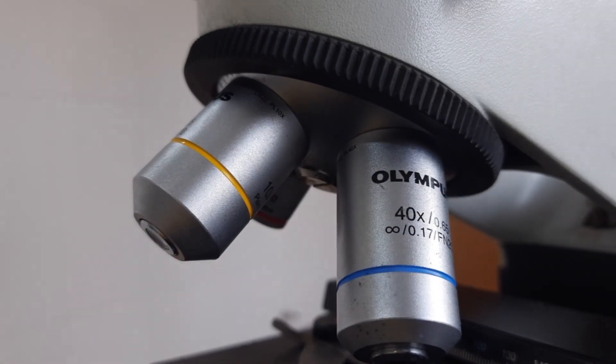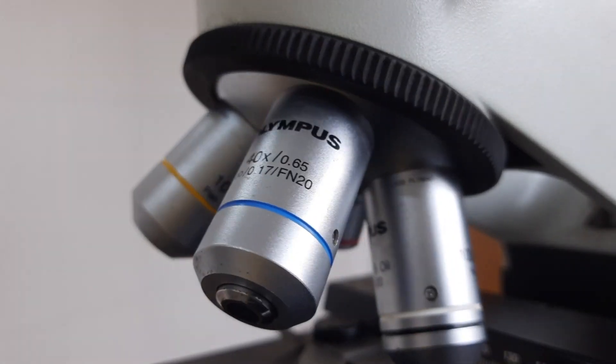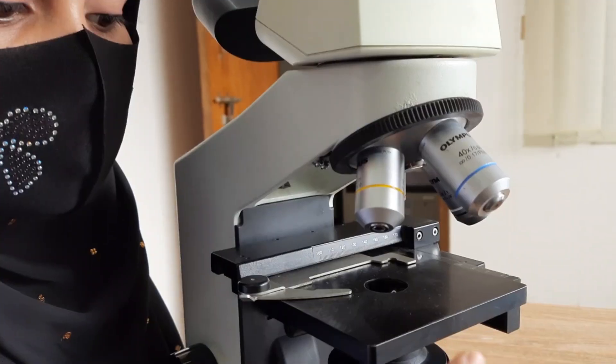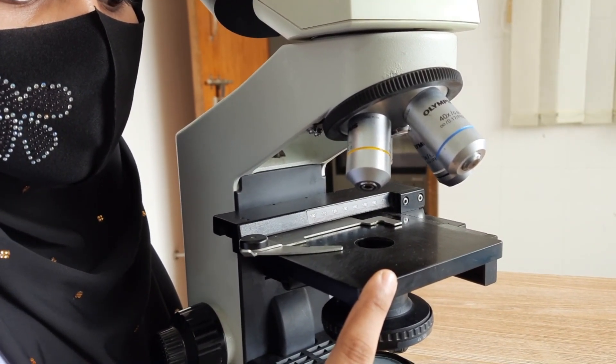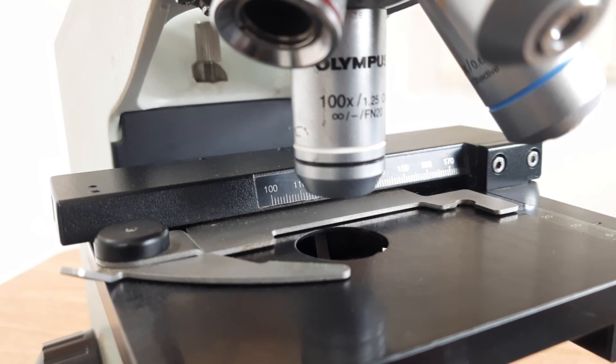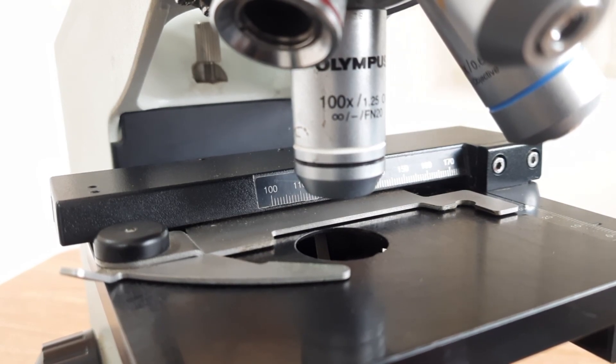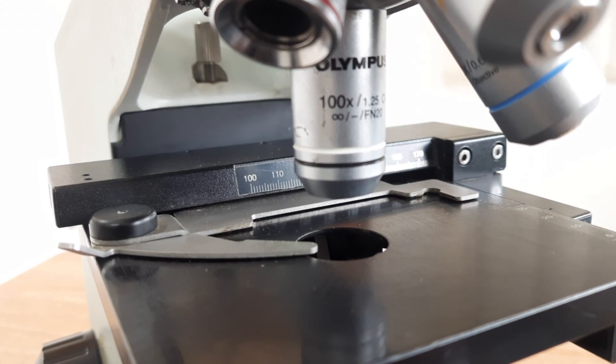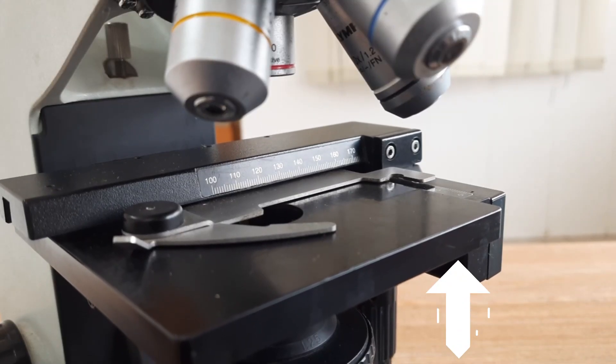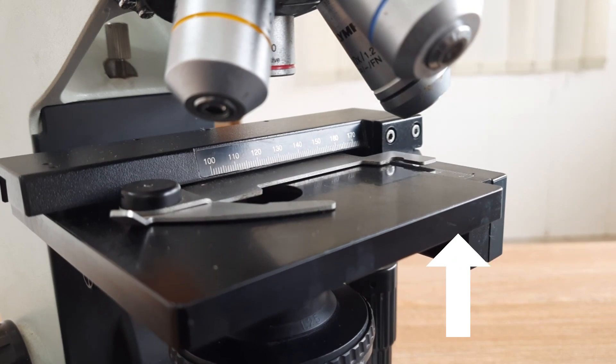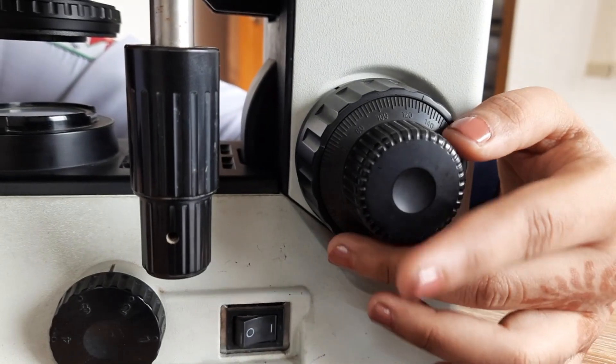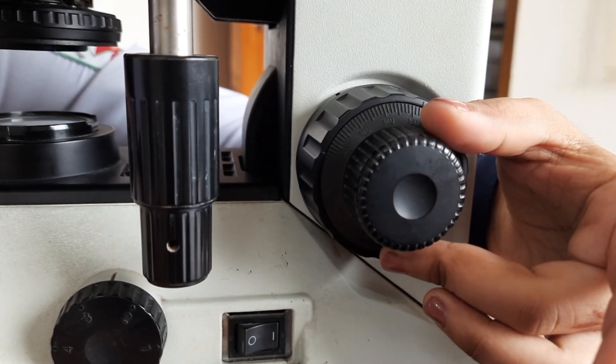The stage is the flat platform where you place your specimen for observation. It often includes a slide holder and stage clips to secure your slides in place. Some microscopes have a mechanical stage with controls that allow you to precisely move the specimen horizontally and vertically. These controls make it easier to navigate your sample.